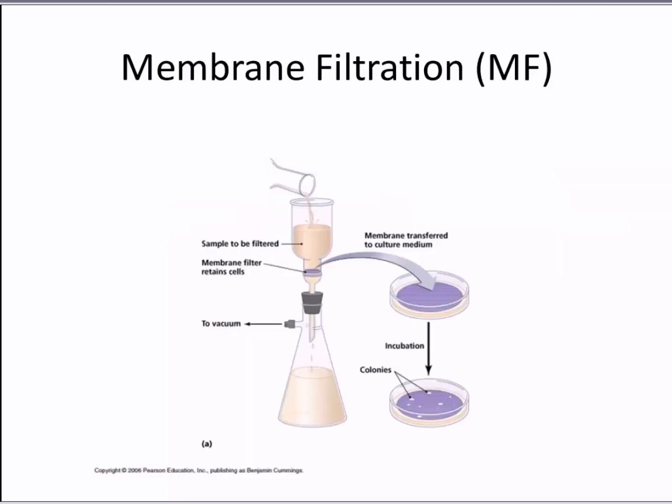Okay, so now I want to talk about membrane filtration. Here you see a figure that shows a water sample basically being poured onto a membrane, which allows the water to pass through while capturing the bacteria on this filter or membrane, which is then transferred to culture media that's designed to detect the indicator of choice. The media is incubated for 24 hours, and then on the next day, the colonies that grow on the media are counted.